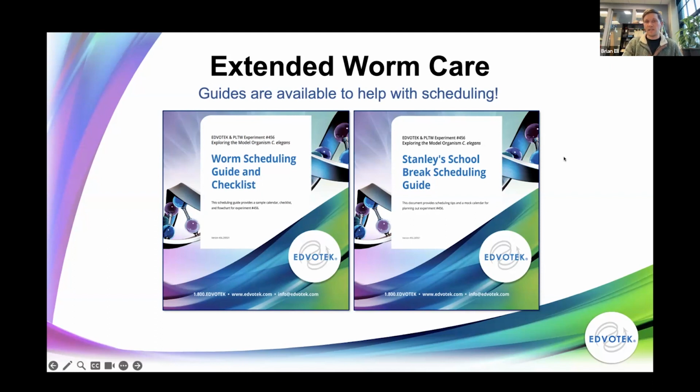We do also have another guide that we've created that is Stanley's School Break Scheduling Guide. And as I mentioned, with Thanksgiving and winter breaks coming up, this one is really useful for helping to plan out how to factor in these different breaks and when to maybe split up Module 1 and Module 2, or how to prepare the worms to survive over those different breaks.